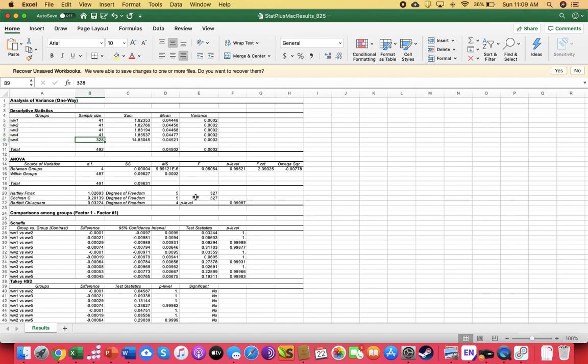I shouldn't have added that into the statistic, but you can see there are a whole bunch of them because it's worms 5 through 12. But the mean is really similar, it's 0.045. So even though our sample size was really big for this one, because our means and our variances were identical, the statistics said, yeah, you can use that as a group if you want to.